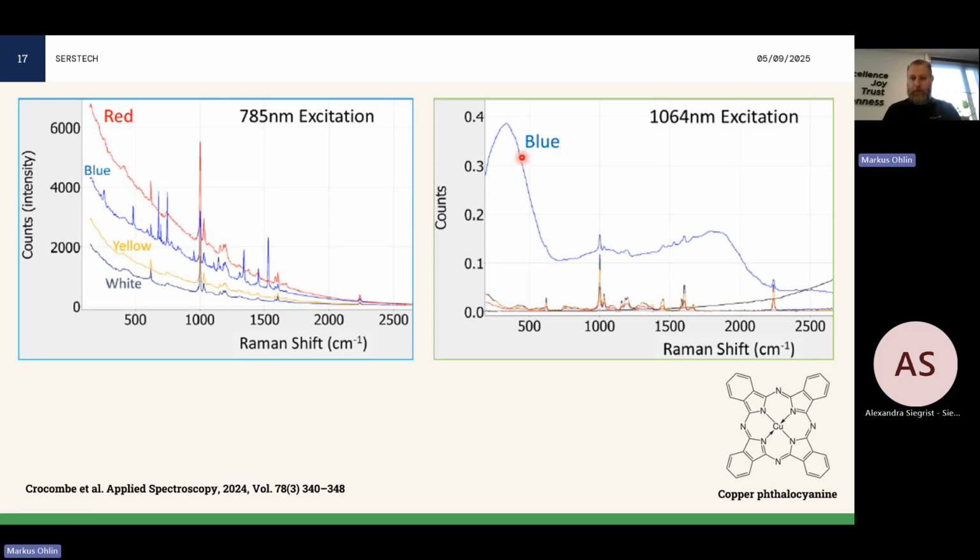But these wavy, big, flowy lines are attributed to fluorescence. And in this case, here it's the sloping signal, sometimes we refer to it as a ski slope. It curves up towards a maximum somewhere at the lower wavelength. And then you see the tail end of that signal where you also see the Raman signal.